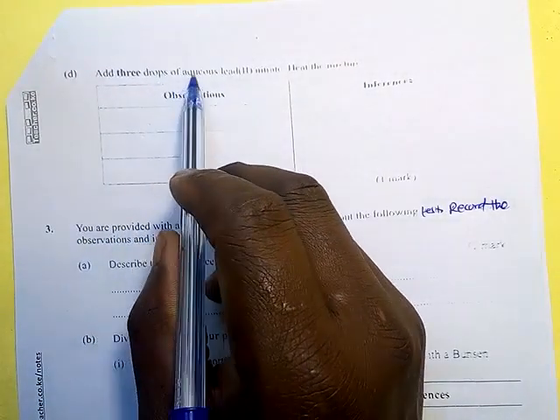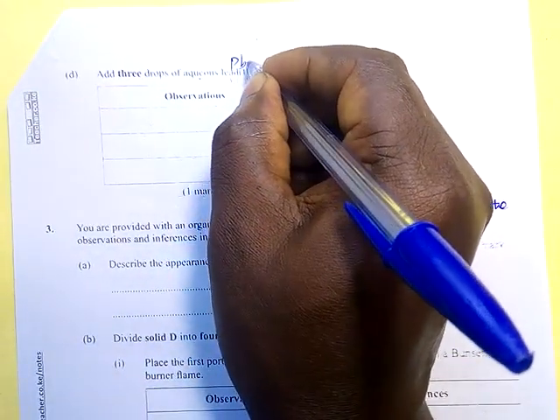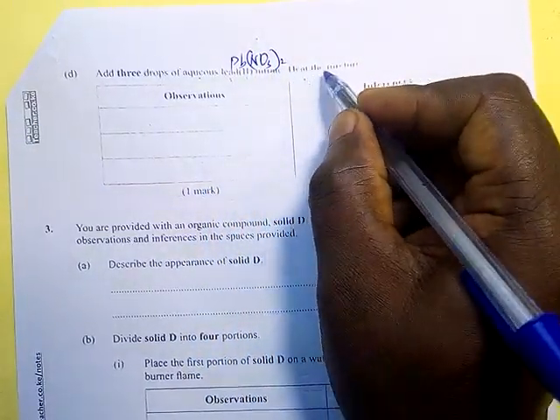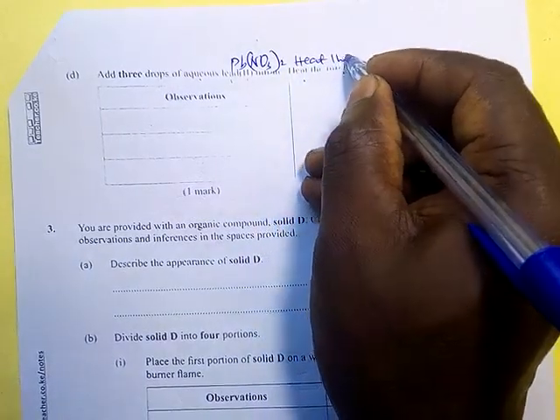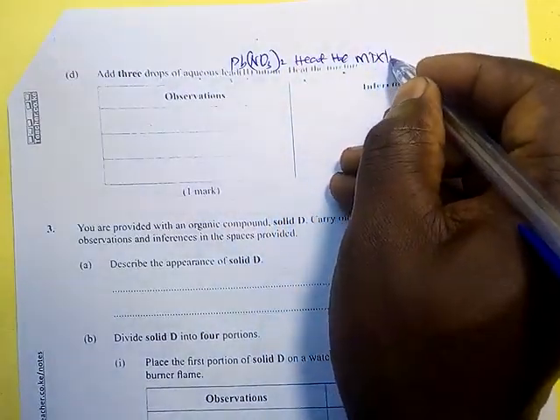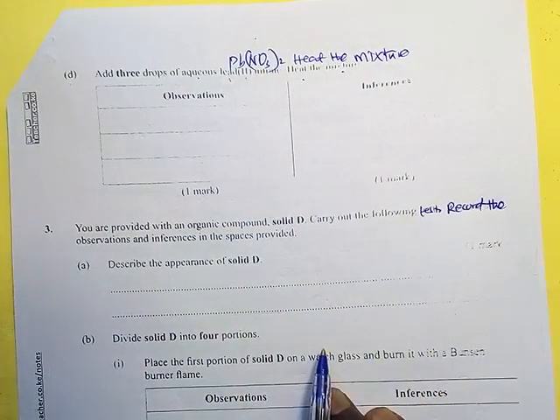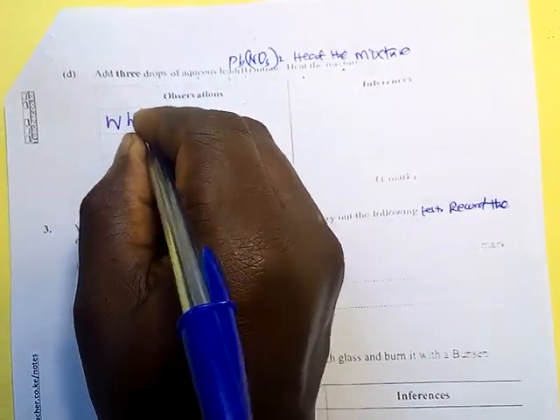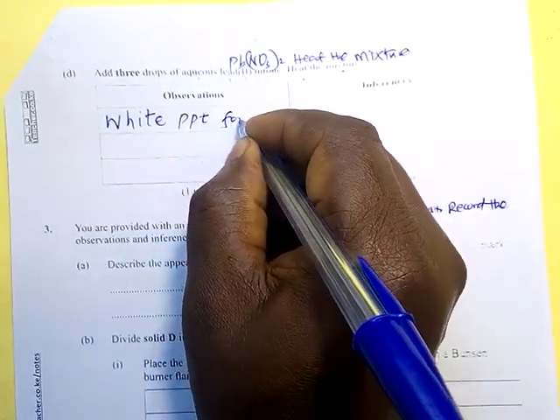Add 3 drops of aqueous lead 2 nitrate. Lead 2 nitrate. Heat the mixture. We have been asked to heat the mixture. Then this is the observation. A white precipitate, white PPT formed.